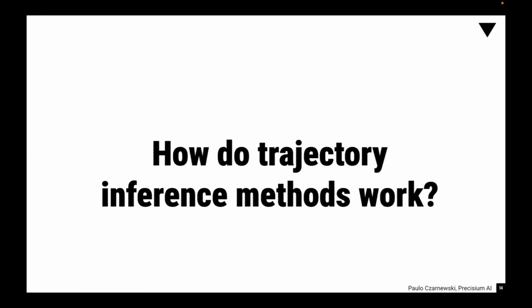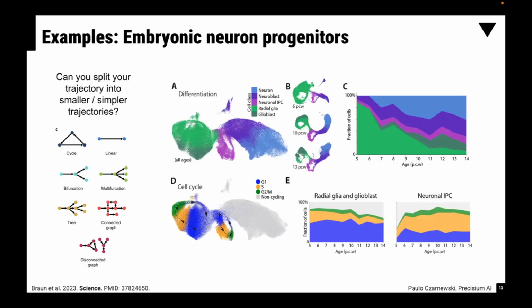I'm curious how important it is to really nail down the exact trajectory model that we want to use. Yeah, it's very important, because actually you will choose the tool that you want to use based on that. Not all tools are suitable for all these applications. There are tools that can only apply to one or another. So for example, as you get more complex, the number of tools that you can use is actually very limited. There are maybe 2 tools that you can use.